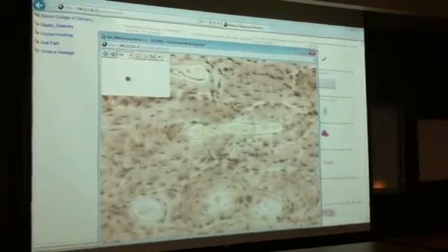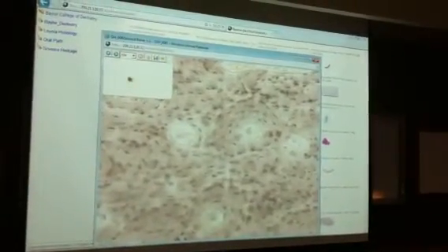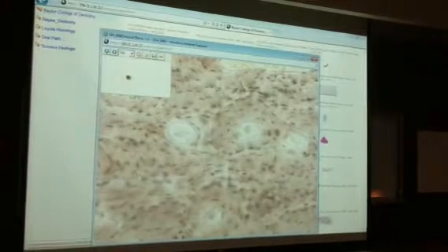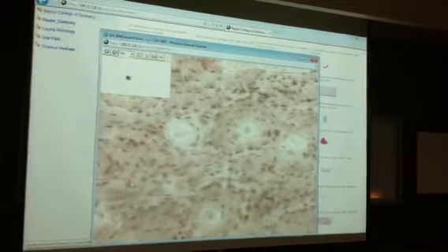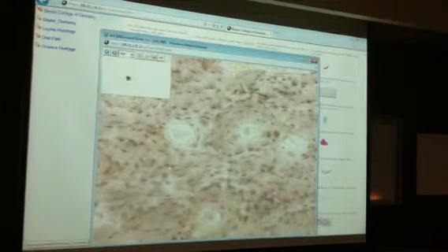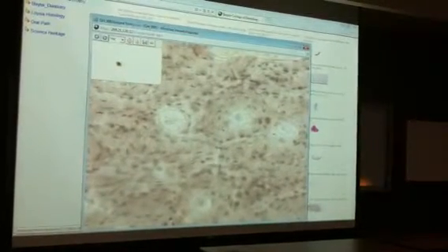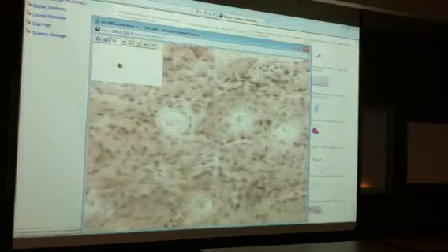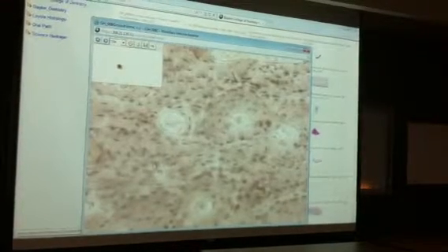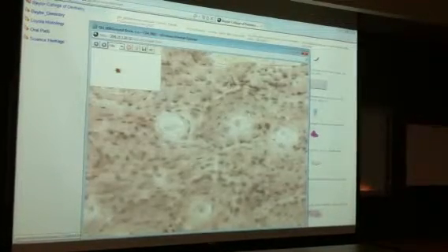Okay? So when you look around through here, obviously you see different osteons, Haversian systems, or whatever. Then you see all this stuff that you find in between. So this material through here would be what? Oh, you don't let me say it. What's it going to be? Is it lamellar in nature? Yeah. What types of lamellae do you have? You have concentric and you have interstitial lamellae, or inter what? Inter something. Okay. Enter the Sandman, maybe. Yes.